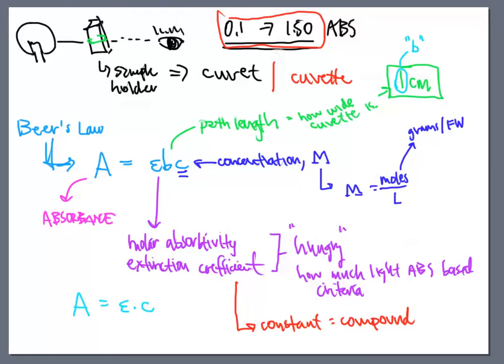So what begins to happen is that I have to have a resource. I have to have some kind of reference textbook to pull this molar absorptivity number from. Okay, so the constant is particular to the compound. The constant I can get from the Merck, or from the CRC, or from the Sattler.